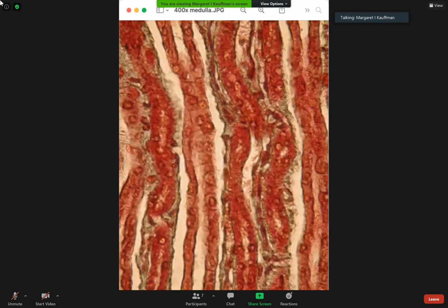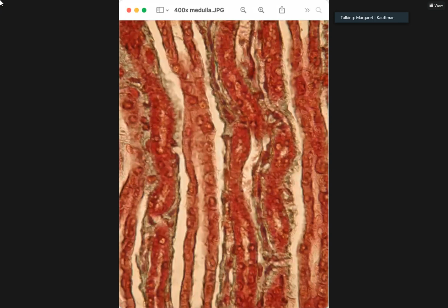If nobody else had a question, I was wondering if we could go over the medulla slides and just recognizing the kidney medulla. Yes, it's all the Christmas colors in them. Okay, this is the one I just randomly picked, one of the two. That is not the world's best focus. Let me see if I can get something that's a better pointer since it's kind of small.